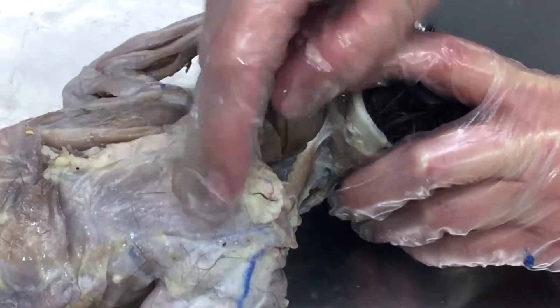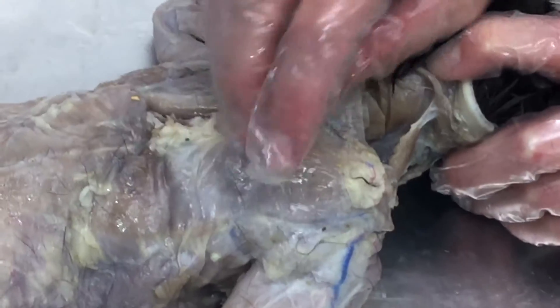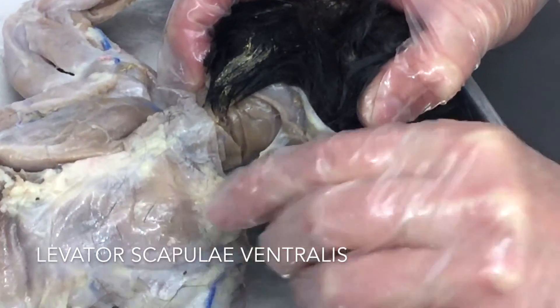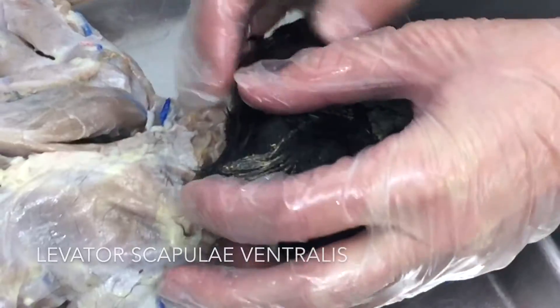We're going to start with the shoulder muscles in the back. First thing you need to do is get the trapezius off — that's what this side is showing, while this one still has the trapezius on. Be careful when you cut your trapezius because sometimes you'll cut your levator scapulae. This little guy here goes from underneath the trapezius down to the scapula and up to the neck — that's your levator scapulae.